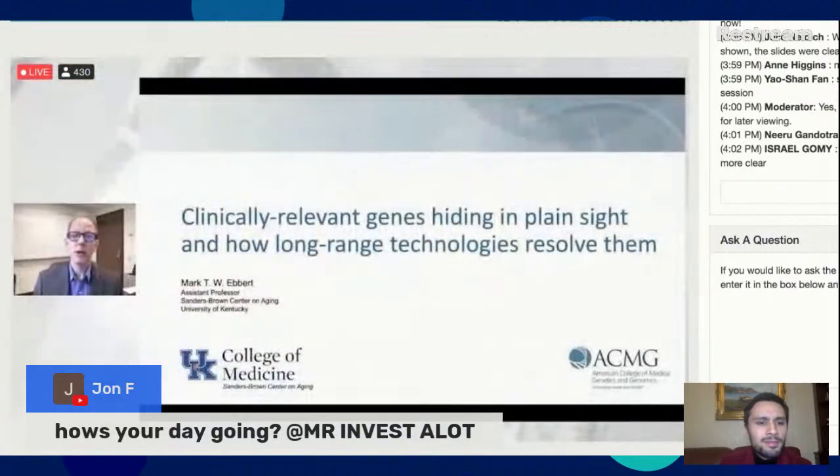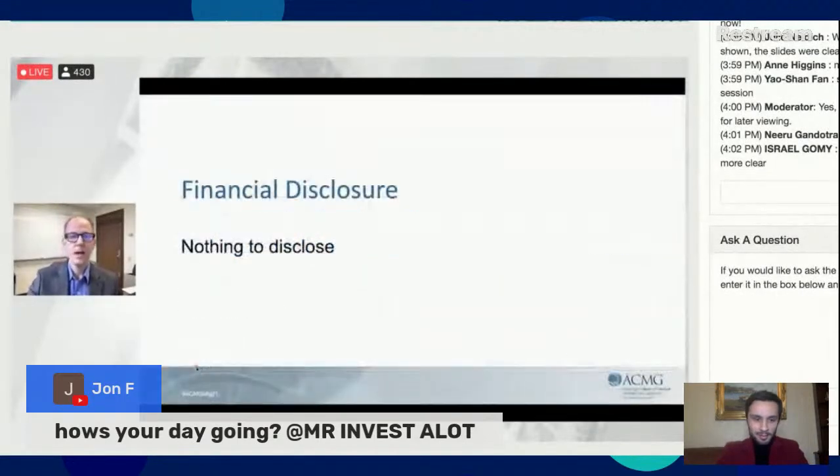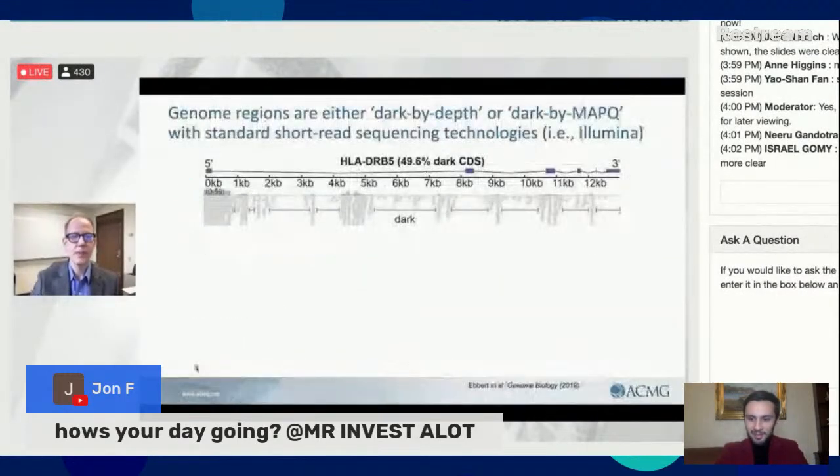Hello, I'm excited to be with you today and to share some of our recent data and some data from a recent publication. So the title of my talk is Clinically Relevant Genes Hiding in Plain Sight and How Long-Range Technologies Resolve Them. I have nothing to disclose.